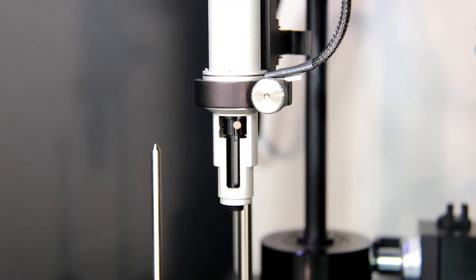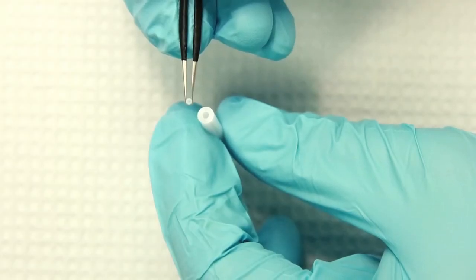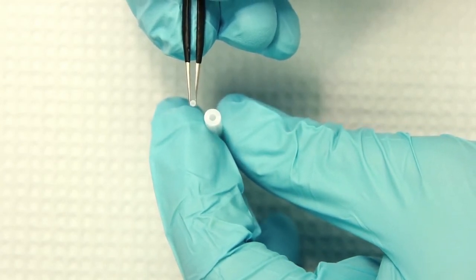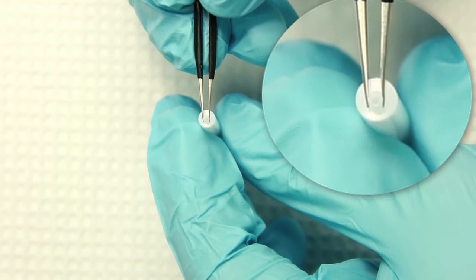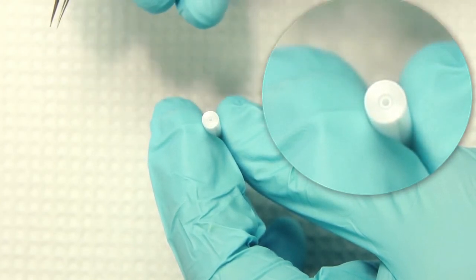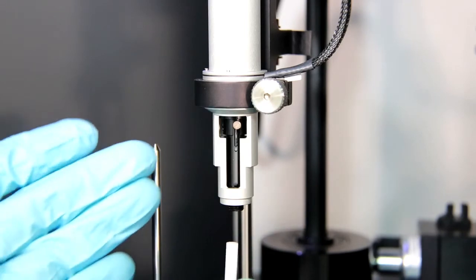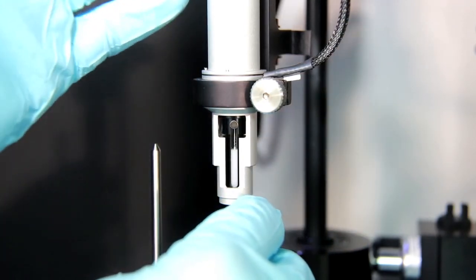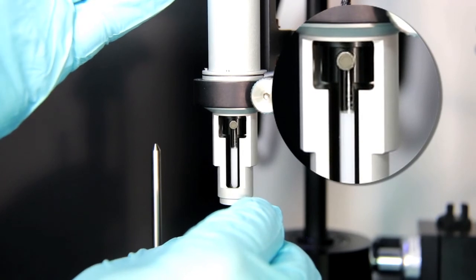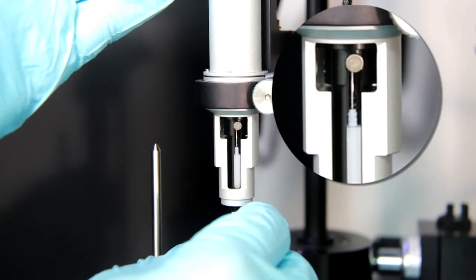To install the new tip, click the Install New Tip button in the ITC200 software — this moves the plunger into place. To install a plunger tip in the tip pusher tool, simply hold both the tip pusher and the plunger tip with their holes facing up, then carefully insert a plunger tip into the end of the tip pusher tool. Once the new plunger tip is installed in the installation tool, slip the tip pusher tool up into the pipette body until you meet some resistance. Give it one final small push to engage the barbed design of the plunger tip, then remove the tool.